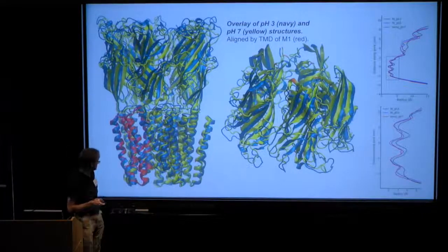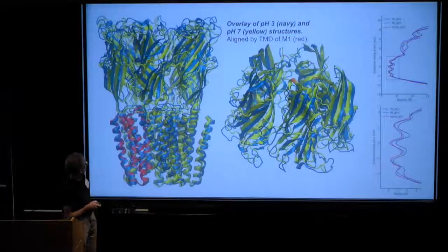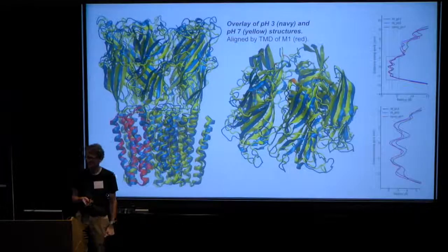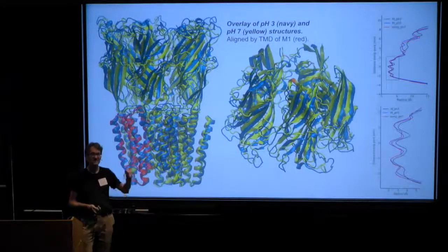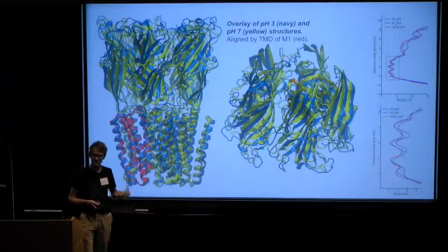And these are basically the end examples of the structures. I'm not sure how interesting that is to you, but it basically means that we can actually resolve, even though we've done completely automated models, we get, I think, structures that are, to first approximation, just as good as the ones that Urska, my student, spent 2 weeks doing manually. And we resolve differences, the radii inside the pores and everything. But again, this takes less than 1 hour to run because it's an even smaller system. So you get these over lunch for free.